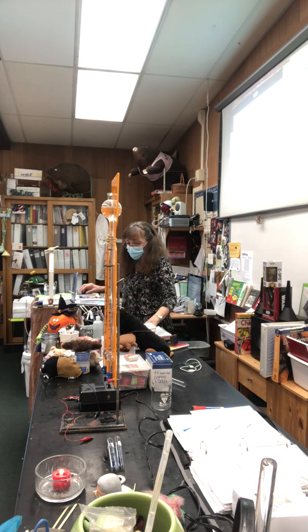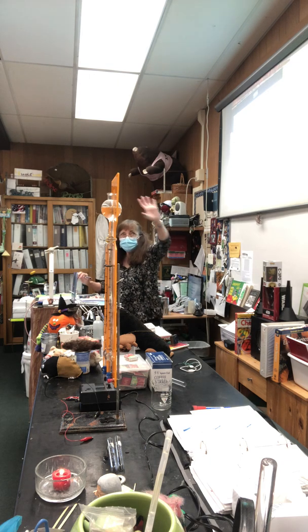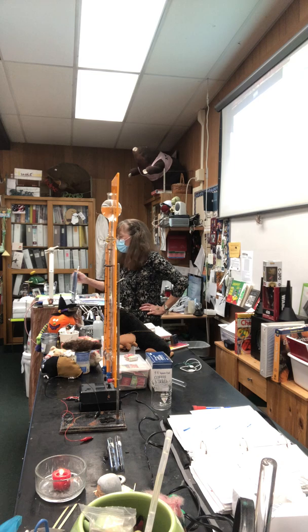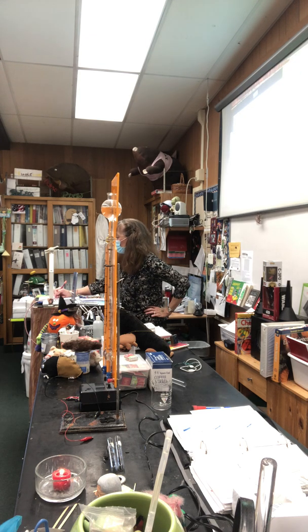Is water a compound or an element? Compound! You guys all should say that. Come on, you guys. Okay, it's not on the periodic table, so it's a compound. Hydrogen and oxygen are? So we're taking a compound and breaking it into its component elements. What kind of change is that? Chemical or physical change? One thing becoming 2 different things is chemical. Okay.